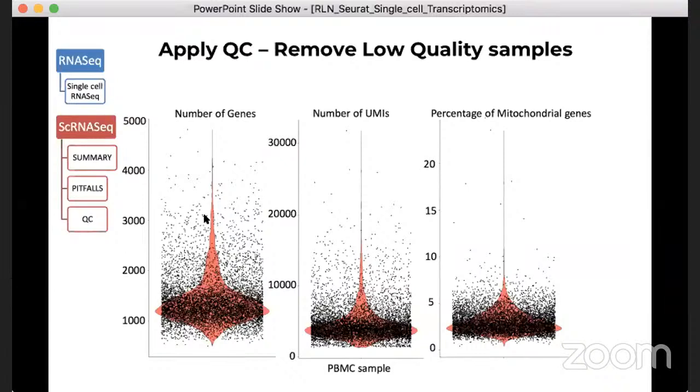Visualization will be different for different data. So for this data, we can use a cutoff of, say, 2000, which will cover most of the cells, most of the samples, and most of the genes, above which we may suspect that we have different problems, or we have low quality cells that we do not want to consider for our analysis.